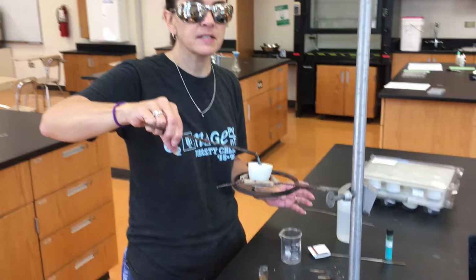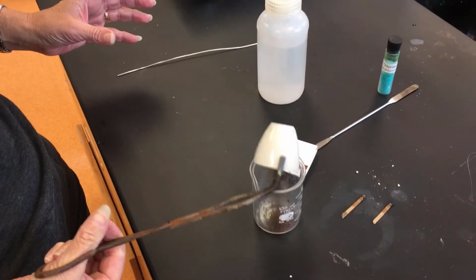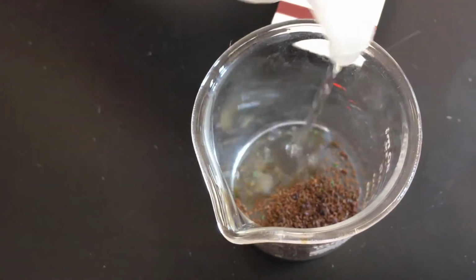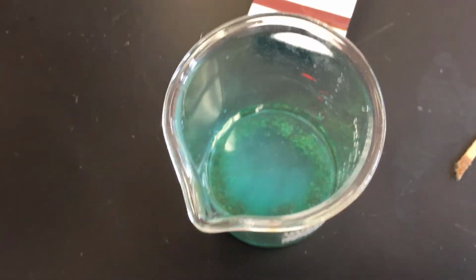So I'm going to take this sample and I'm going to pour it into a beaker. And I'm actually going to rehydrate the sample. So I'm going to add more water to it. And you can see it go back to that beautiful green color.